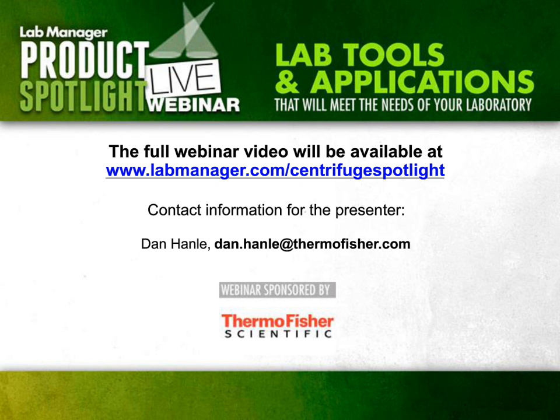We could keep going with some of the things, but those are probably the key ones. But let me mention one, just wrapping this question up. You mentioned the centrifuge. In our world, in the floor models for sure, it's the rotors. Folks will leave a rotor in the chamber, which is fine, especially if you want to keep it cold in there. But what we have said for years is, especially if it is a metal rotor, to please take it out, rinse it out, and turn it over on some kind of absorbent towel, and let the water and any spill get out of it. Because sitting down on the bottom, they eat away in there and corrode.